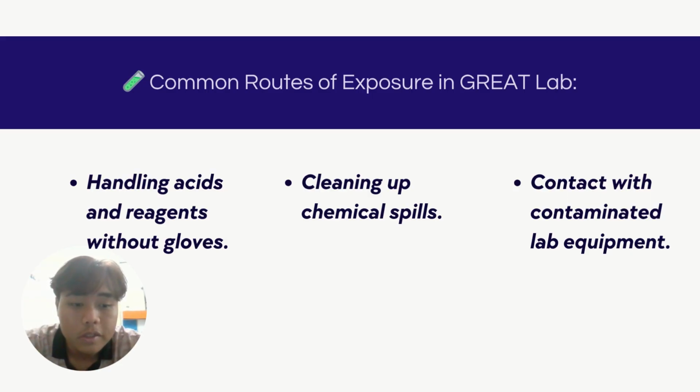In the gold analysis lab, there are several common routes of exposure. The first one is handling acid and reagent without proper gloves. The second is cleaning chemical spills or using equipment that has chemical residue.